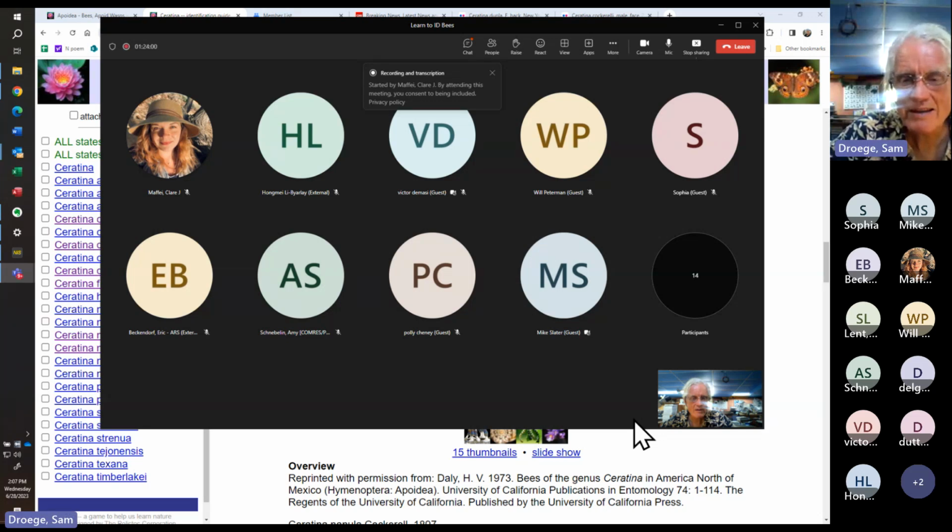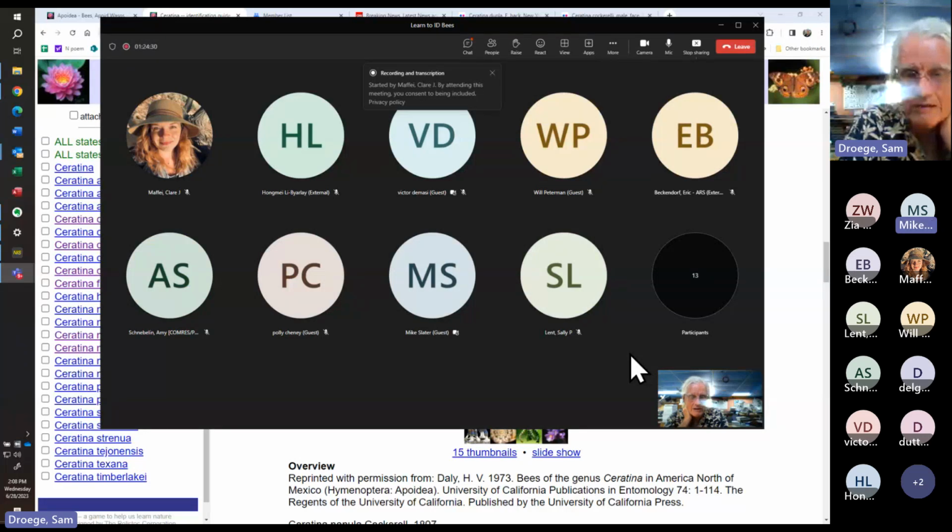So there should be, I'm going to say, no lines between the parapsidal lines and the center line. What might be happening is a partial collapse of the scutum that makes troughs. The kind of stuff that I was seeing online were areas of reflection bouncing off of some kind of depressed area that was quite different in aspect than the lines themselves.